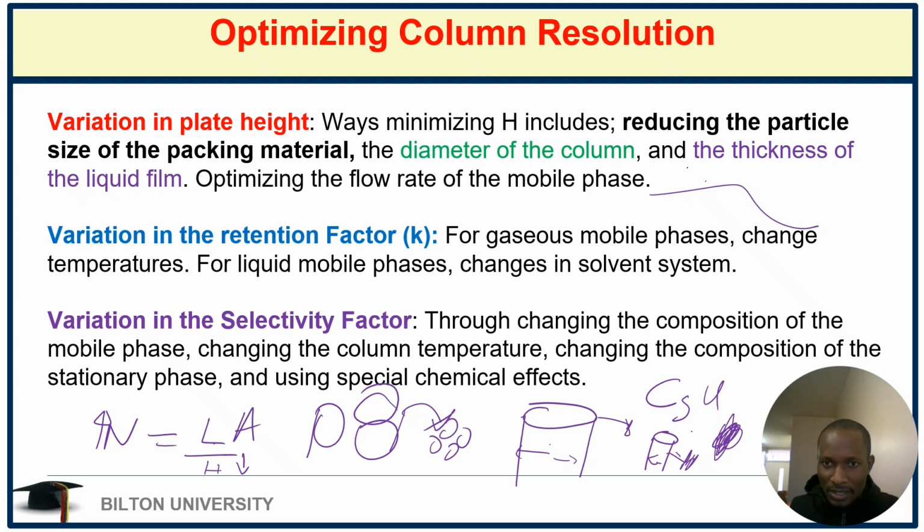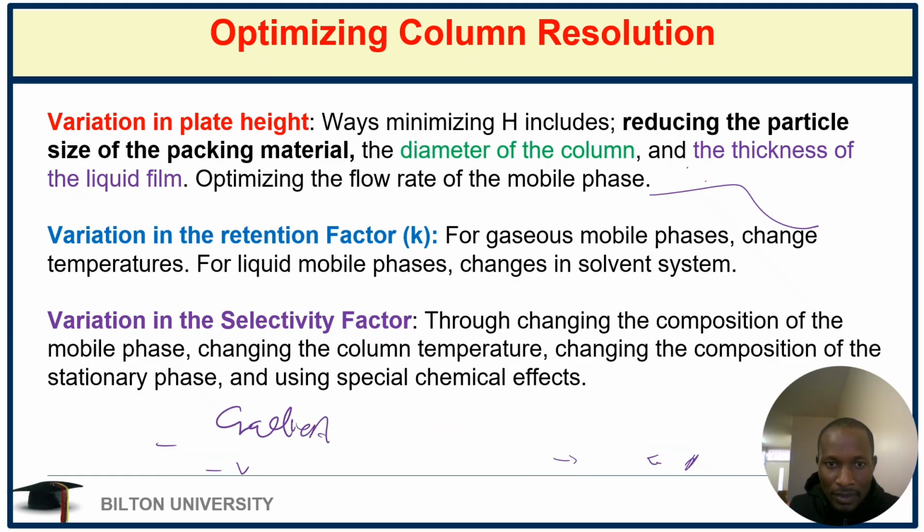We are going to explain them there. So gradient elution, here the best is gradient elution, whereby we are changing the solvent system. We may start with, let's say, 90% hexane versus 10% DCM, and then we see that this one gives us this separation.